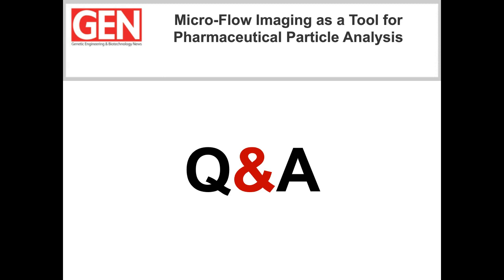Another disadvantage of MFI I would like to mention is that you really need to dilute your sample quite a bit in order to prevent coincidence of particles. If you use a too high concentration, then the particles will be located really close to each other, and the MFI will detect these two particles as one particle. So you really need to dilute your sample. Well, Mastersizer samples are also diluted, but definitely less.